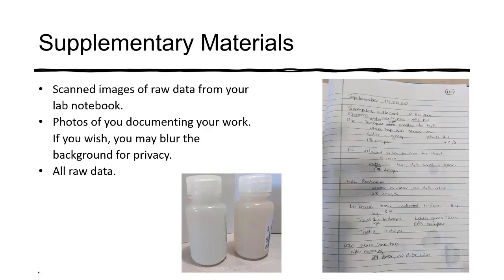Those supplemental materials will contain all of your raw data, images from your lab notebooks, photos documenting your work, anything that provides supplemental information to demonstrate what you have done.